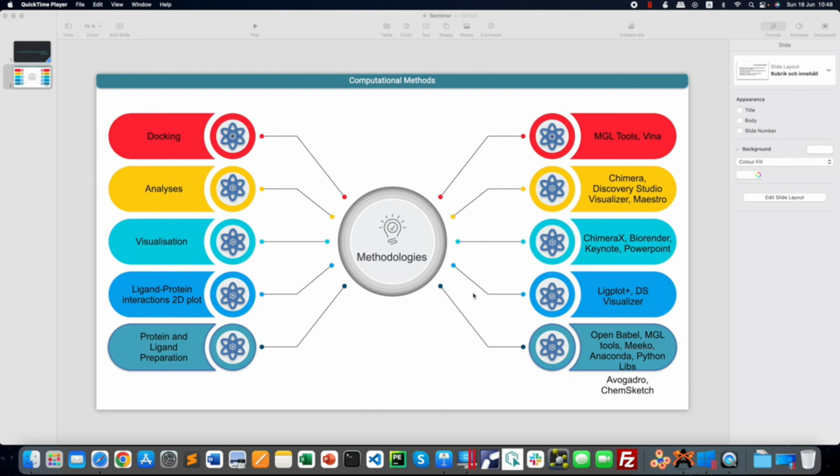In silico methods are extremely useful for both finding potential binding sites and also to discover or engineer new molecules that could bind to a known site of the target. The purpose of this practical is to give a flavor of how one could dock small flexible molecules to a protein structure. This is a multi-billion-dollar industry. Virtual screening and blind docking are often employed in an attempt to discover new medicines.